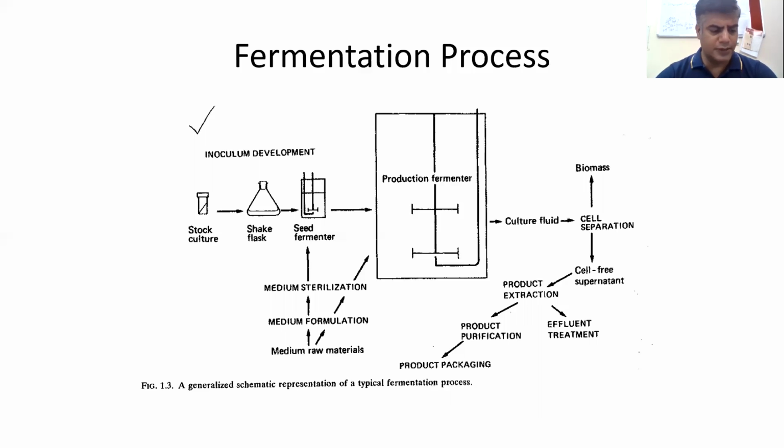Then, on the large scale, the first aerobic fermenters were used in Central Europe during the 1930s for the production of compressed yeast. So the fermentation process is not very new, as we already discussed in the history. And this fermentation process requires aseptic condition. It means the fermenter design should be aseptic.